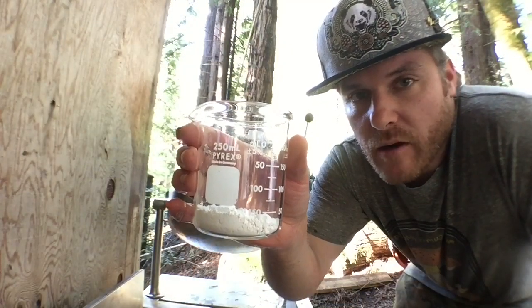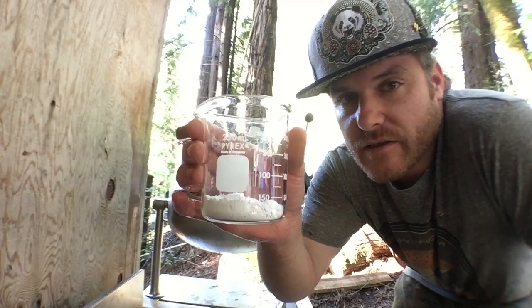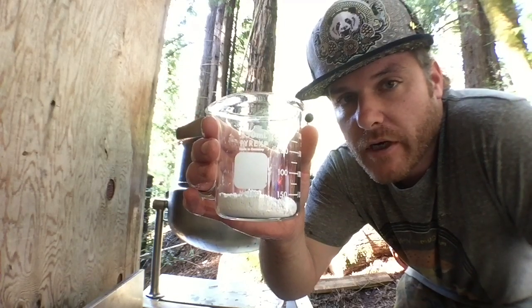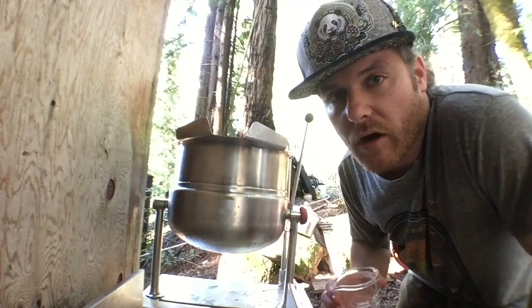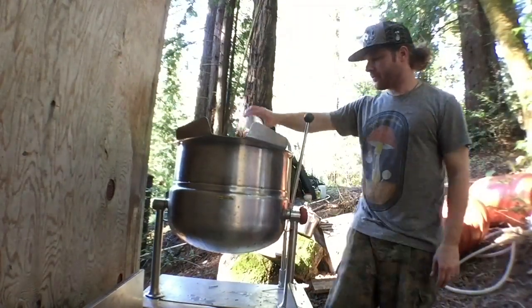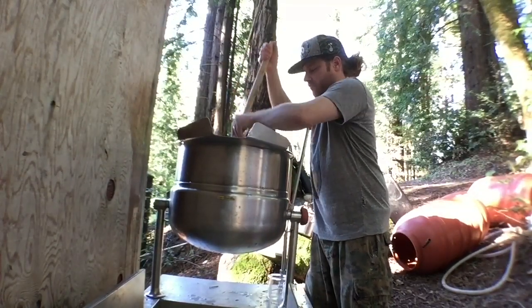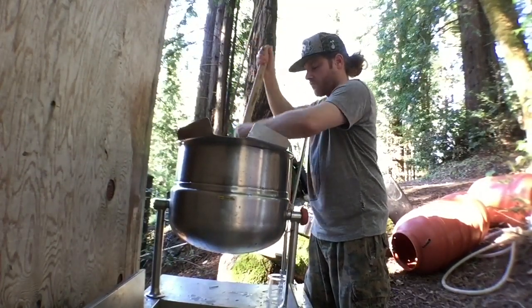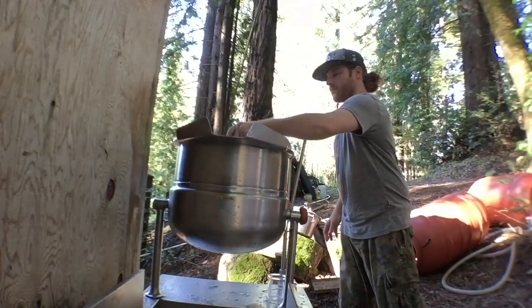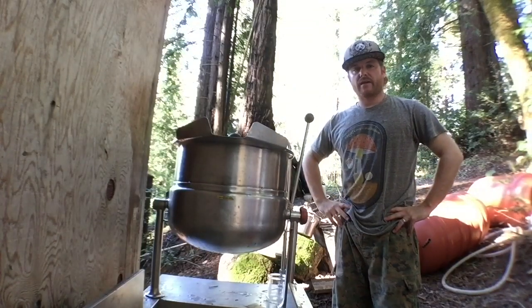Okay, so I've weighed out about 25 grams of gypsum here, and we're going to add this to our grains. And then we're going to put the lid on, and leave it overnight and come back tomorrow and boil them. Okay, there you go. We'll leave them overnight and come back and boil them tomorrow.